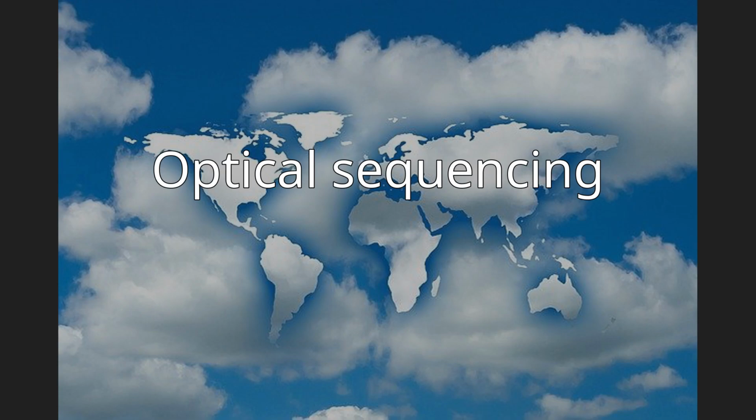Optical sequencing. Optical sequencing is a single-molecule DNA sequencing technique that follows sequence by synthesis and uses optical mapping technology. Similar to other single-molecule sequencing approaches such as SMRT sequencing, this technique analyzes a single DNA molecule rather than amplifying the initial sample and sequencing multiple copies of the DNA.